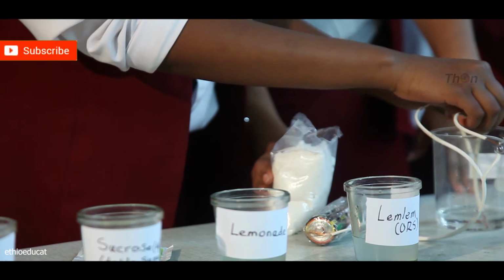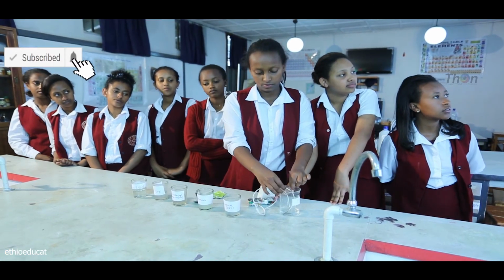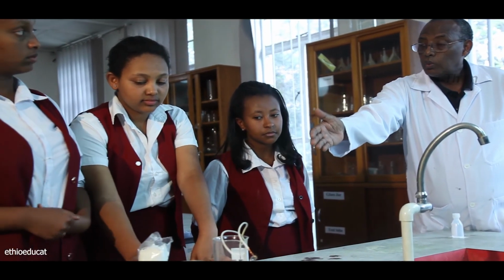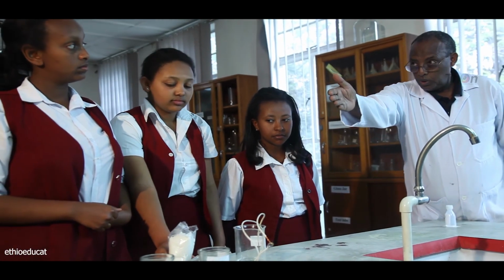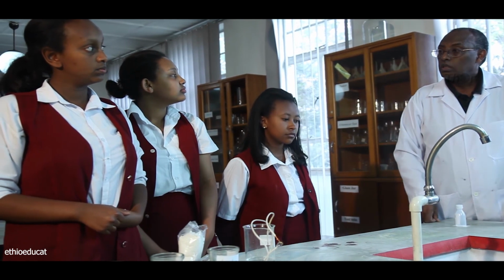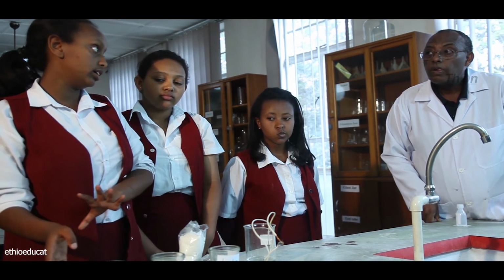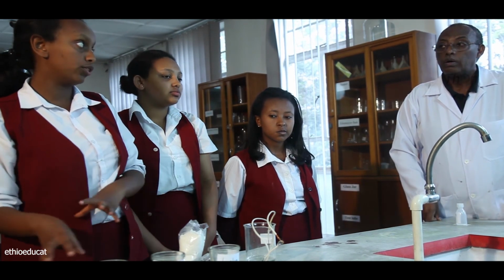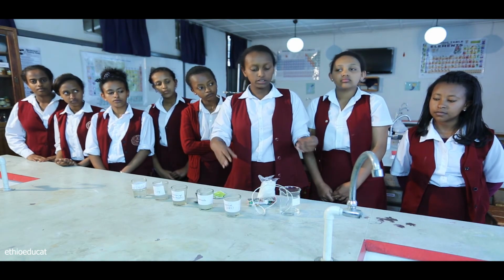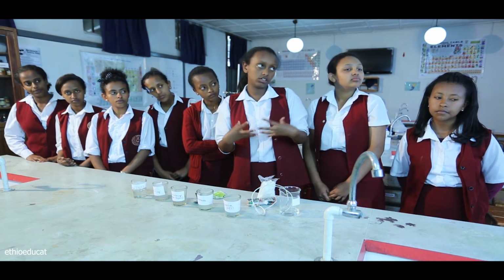It's not an aqueous solution. Well, we have sodium ions here, we have chloride ions here, as we do in the solution, but we don't see current. Because in the solution we have mobile ions. They are free. They move around, so they'll create a bridge between the two wires. But here they're not mobile. They're in a compound form, in crystal form.